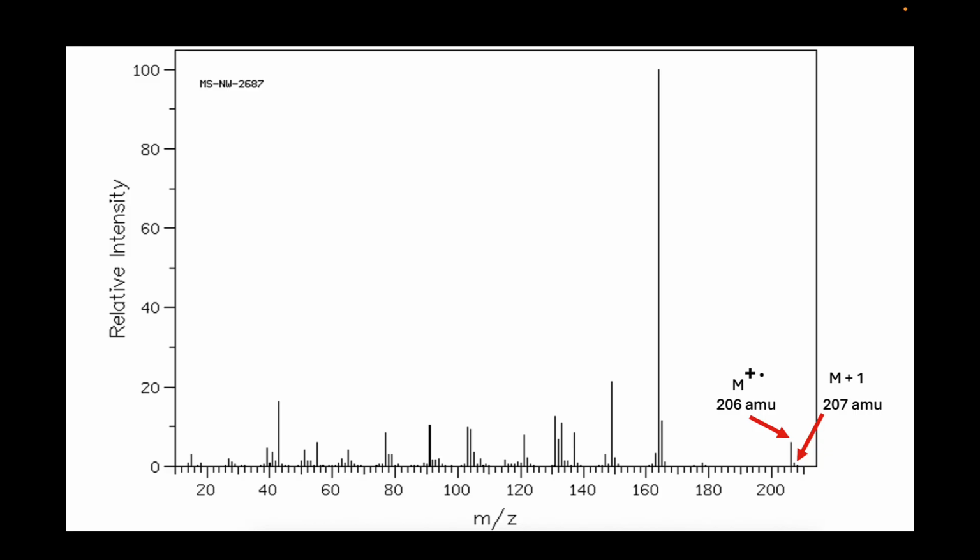This is just because the molecular ion in this molecule happens to be a little bit less stable than it was in the previous example, probably a lot less stable, and it tends to fragment to give a really strong base peak. In this case, that's a lower mass fragment. This happens to be the molecule eugenol acetate. This is another molecule that's present in cloves that contributes to cloves' aroma and taste. It's kind of a minor flavoring component in clove oil.